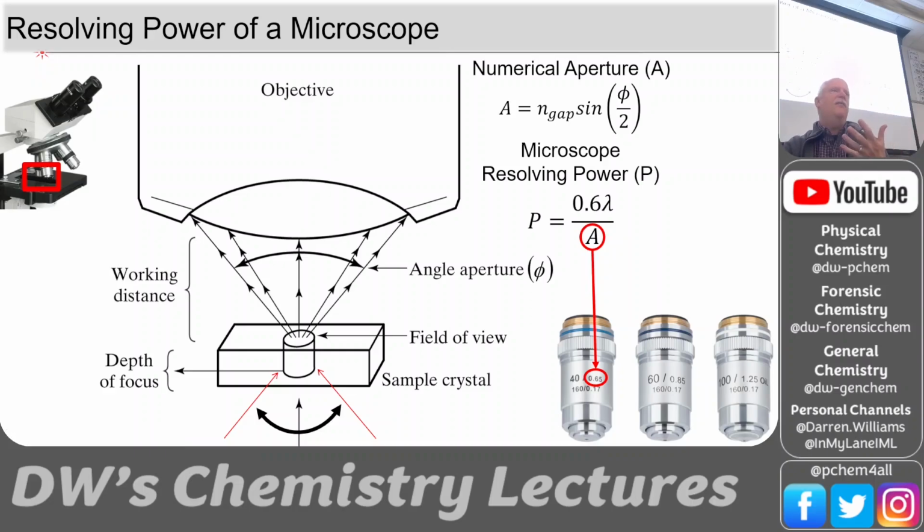Many of these high magnification lenses or objectives are made to work with oil. And so you put an oil drop on top of your sample, and then this fills this gap here. And so that can change this numerical aperture quite a bit.